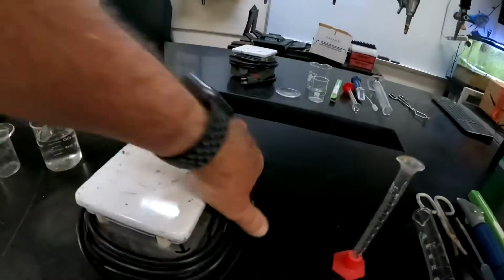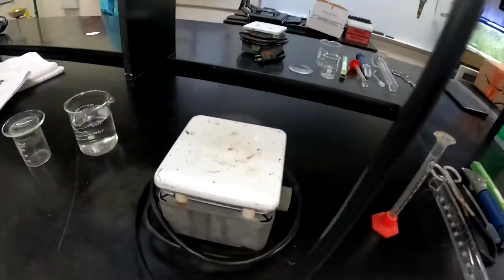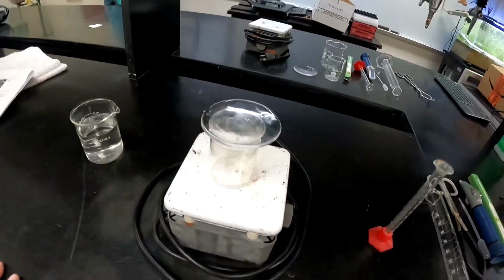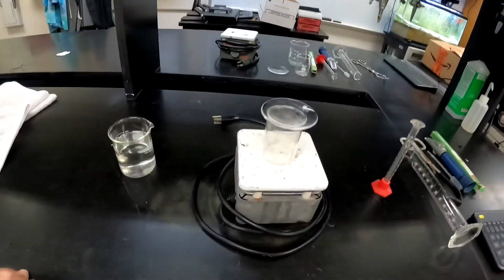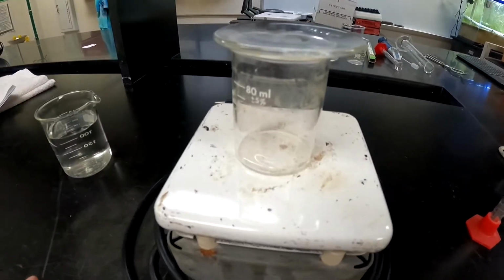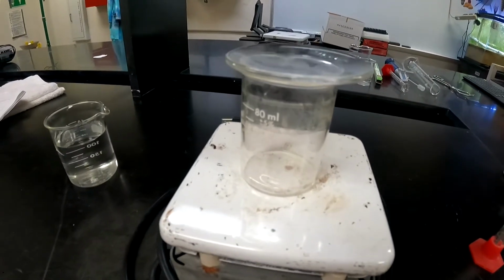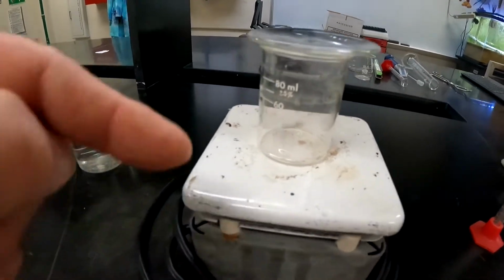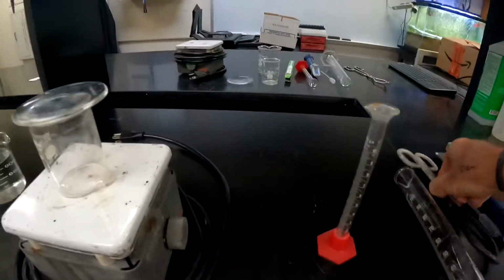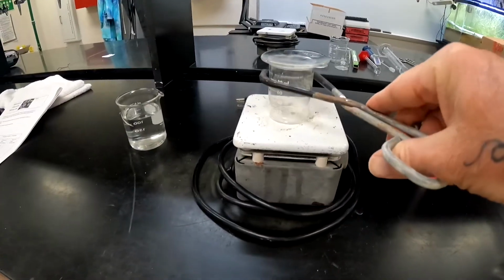Now we plug in our hot plate, turn it on, place this on top of it, and you're going to literally watch water boil until all the water is boiled off and there should just be salt in there. Just before that happens, you should start hearing the salt pop. Almost looks like popcorn down in there. That's why the watch glass is up there. As soon as it starts popping, we take our tongs here and we remove it off of the hot plate.